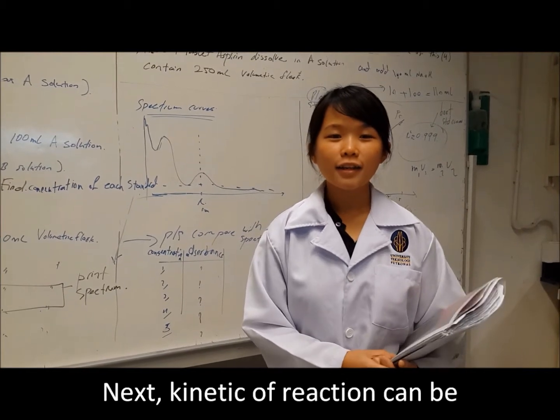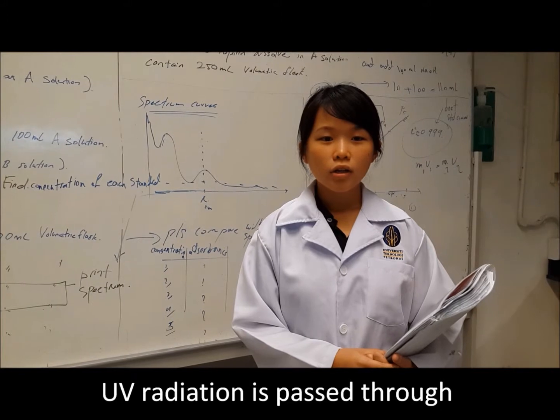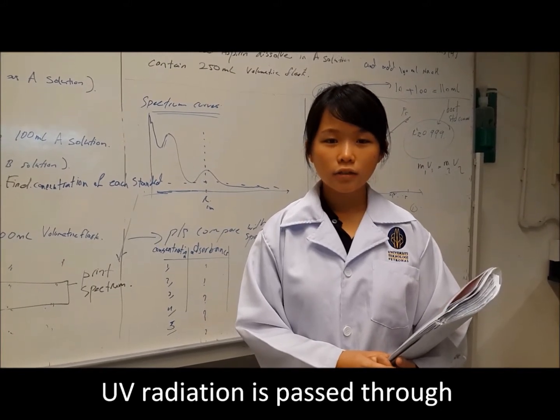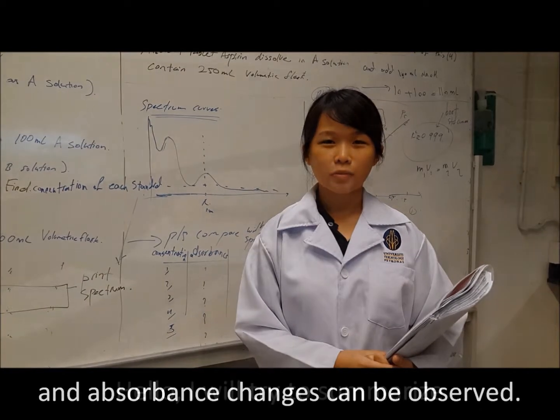Next, kinetics of reaction can be studied using this technique as well. UV radiation is passed through the reaction cell and absorbance changes can be observed.